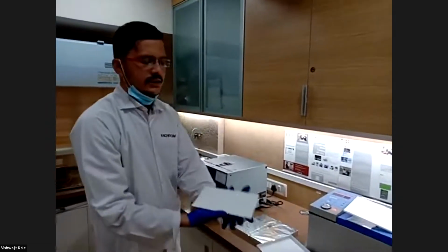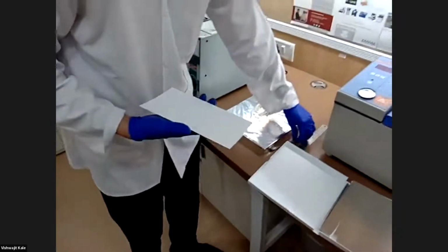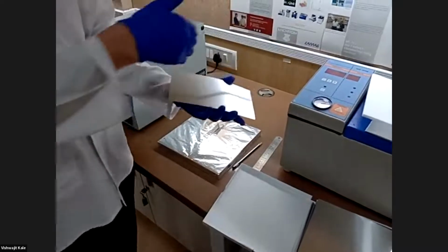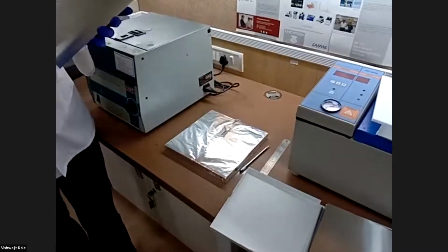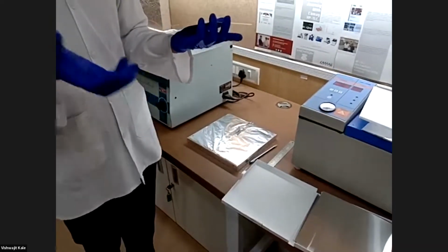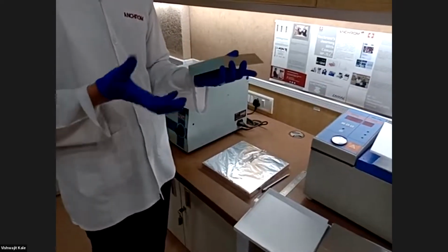So this plate is already cut. These plates are available in 20 by 20 centimeter dimension. We can cut that plate by using a simple paper cutter, scale and pencil. We can mark exact 20 by 10 or 10 by 10 or 5 by 10 dimensions on the plate, and we can cut the plate into 2 parts or 4 parts. But we always recommend cutting the plate in dimensions of 5 by 10 or 10 by 10, in intervals of 5 centimeters. So you can utilize the whole plate properly, and you can achieve optimized and good separation.